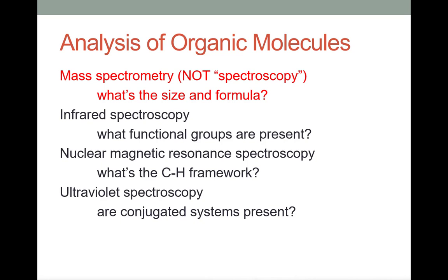Hello, everybody. In today's discussion, we're going to start looking at molecular analysis. This would go along with Chapter 12 in the McMurry Organic Chemistry textbook. And we are going to start with a discussion of mass spectrometry.